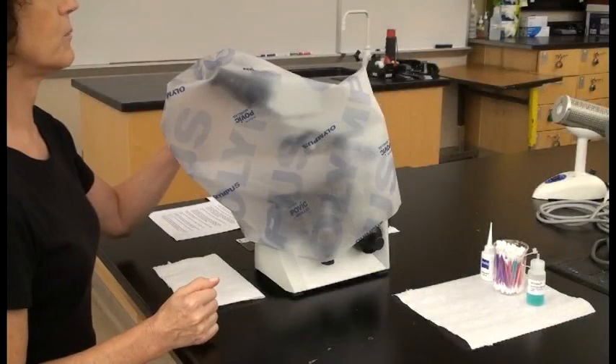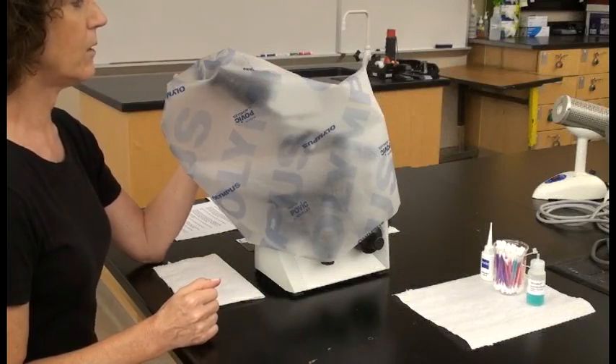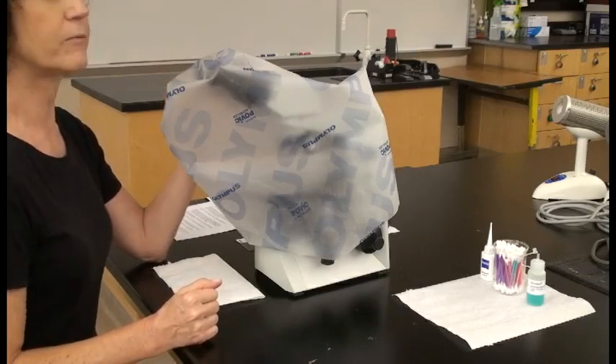Today in this video we're going to show you the different parts of the microscope and also the best way to focus this microscope so that it works for you and is focused for your eyes.